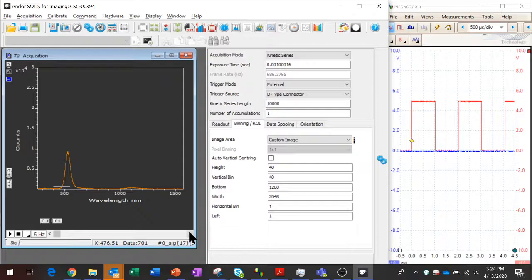I could push this even further, I won't do that for the moment, but perhaps I will in a different video to show the extreme high-speed aspects. So this is just below a kilohertz for the moment.